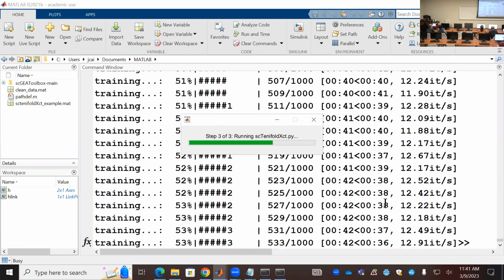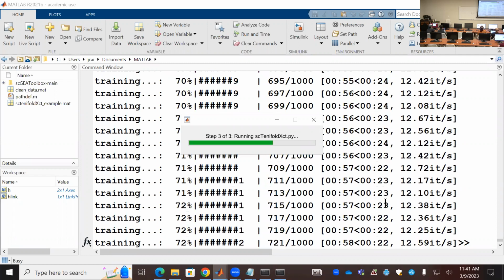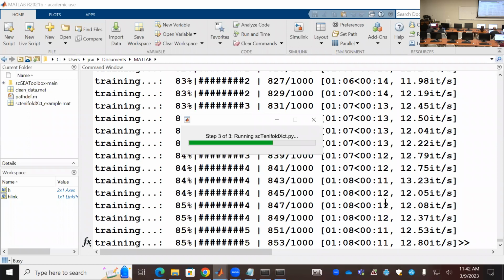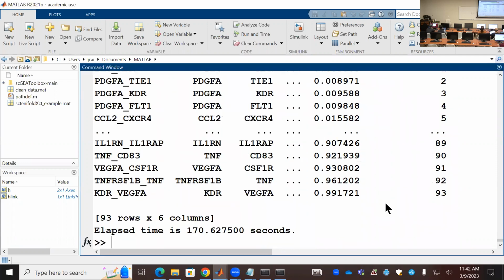Did you save the file? Oh, from the beginning, that will take long. Did you save the file in the middle? No. Okay. Oh, by the way, you can just use example data. We will have the same. Just load the example data, processed.